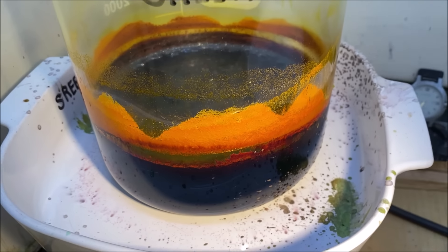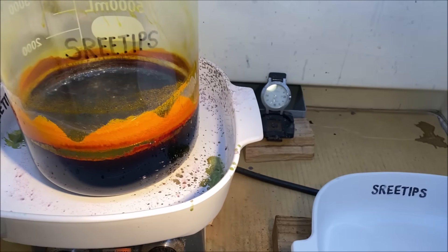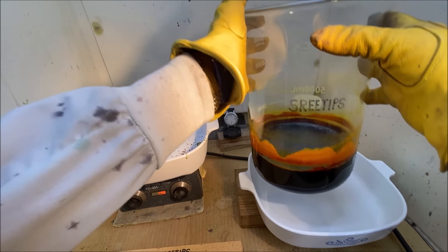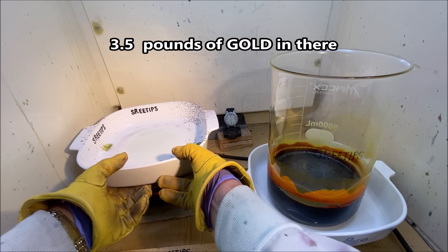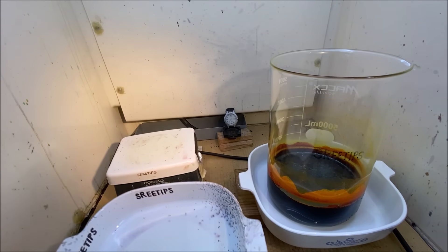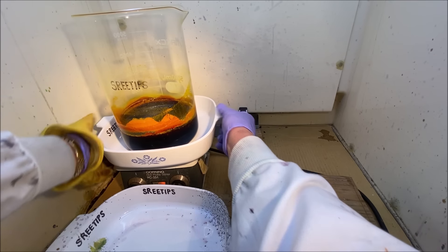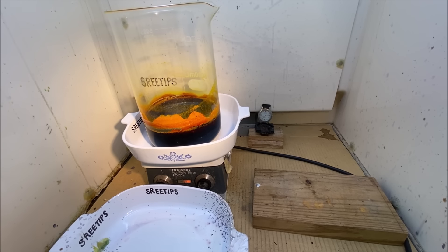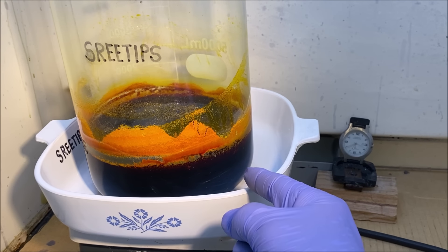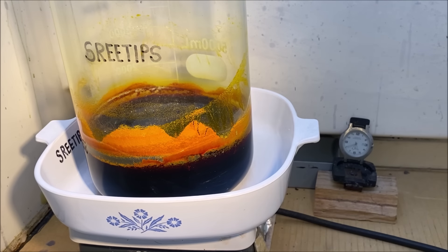I've got a bunch of junk that fell down into the dish here, so we're going to replace this dish with a clean one and continue our experiment. We're going to move this container off onto a clean container — this is just some stuff that dripped from overhead down into this pan. I've got the new pan in place, so now we'll go ahead and put it back on the time lapse. My goal is to evaporate this to dryness so that all I'm left with is solid chunks of orange chloroauric acid.